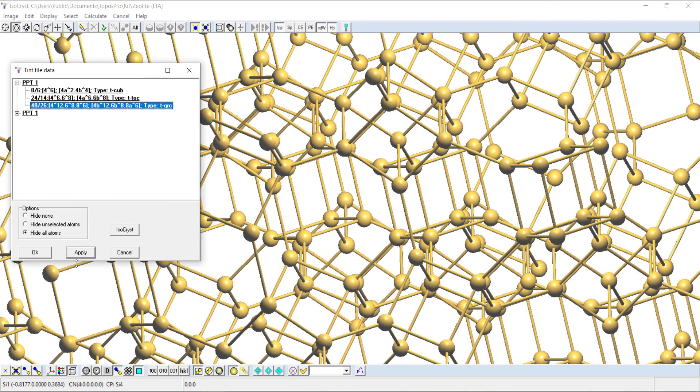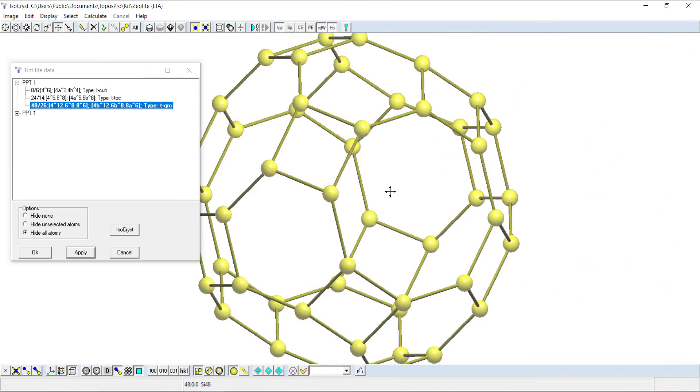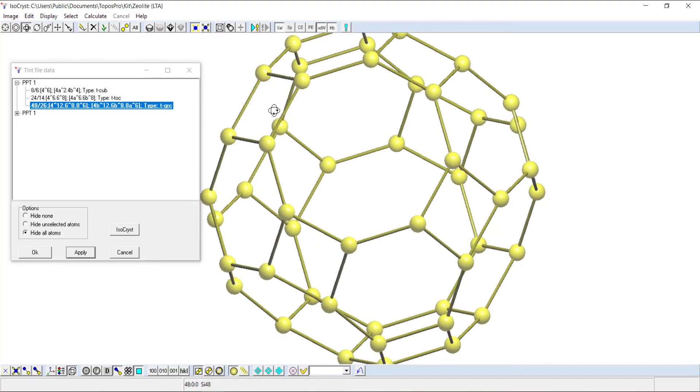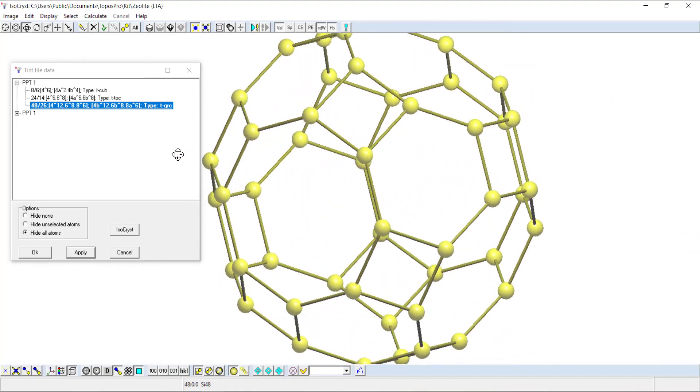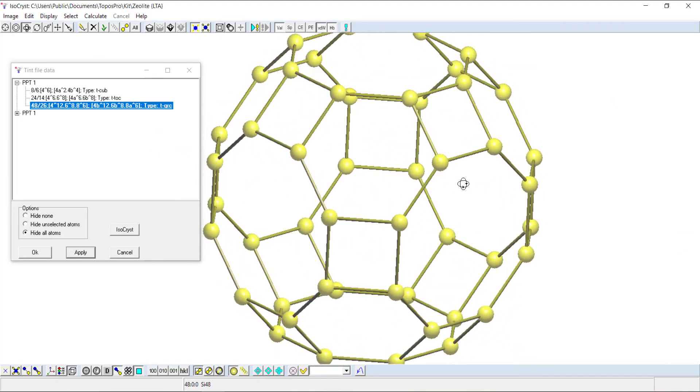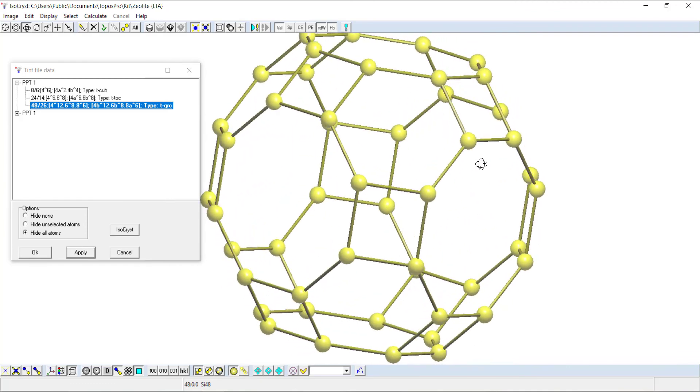If we repeat that again, display that TGRC again, we're back to what we had at the beginning. It's a good way of seeing the atom arrangement in the tiles if you want to have a quick look at them.